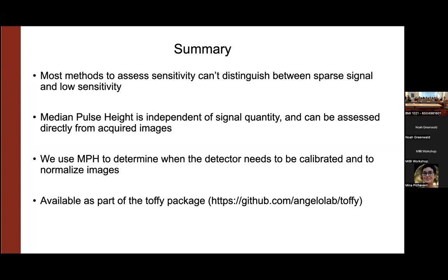Okay, so we observe basically at UMN, University of Minnesota, they're saying they've picked up the same thing where you have tiled images, they're observing these differences that are independent of acquisition order. And so what do you do about that? How does that impact downstream analysis?